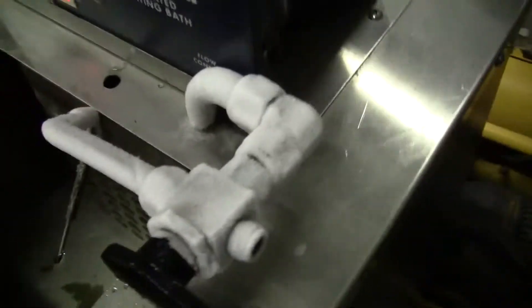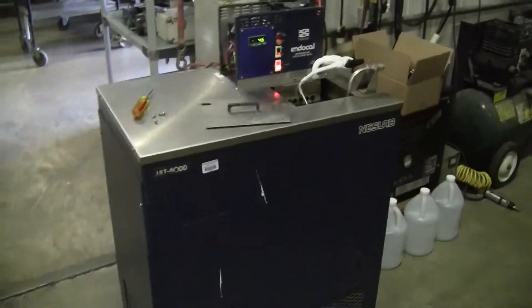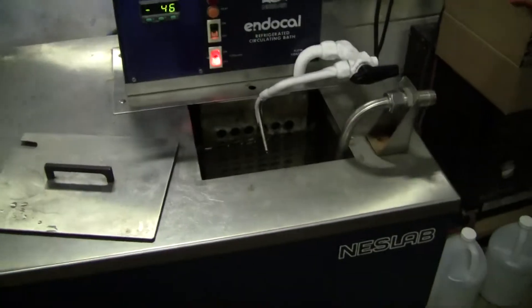The unit runs on 220 volts. Do you have any further questions? Please don't hesitate to call 609-518-9100. We're using isopropyl alcohol as our fluid. Thank you from Hi-Tech Shitter.